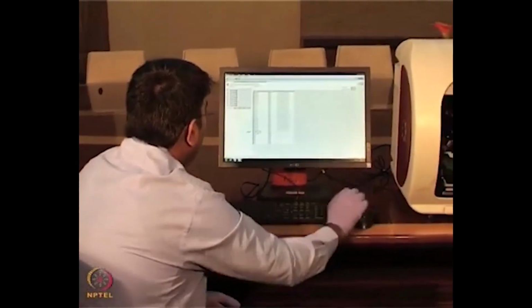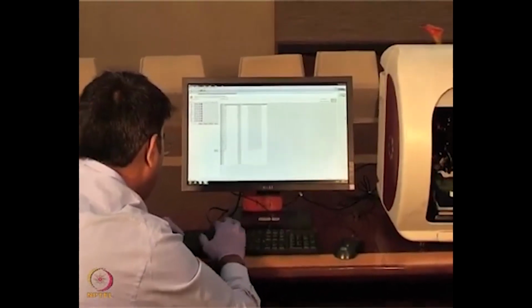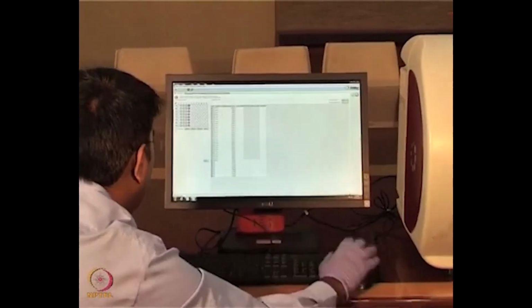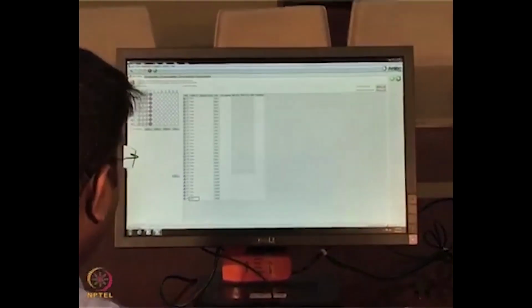Here I am mentioning the mouse monoclonal antibody. I will use mouse IgG. I am using 25 micrograms per ml, and the molecular weight of the mouse monoclonal antibody is 150 kilodalton. It automatically calculates it as 166.7 nanomolar. Okay, I will just copy this one.